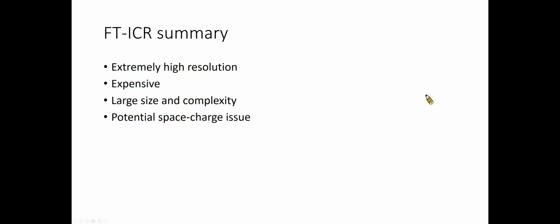In summary, FT-ICR provides extremely high resolution but is very expensive. FT-ICR instrument is spatially demanding and may have the potential space charge issue.